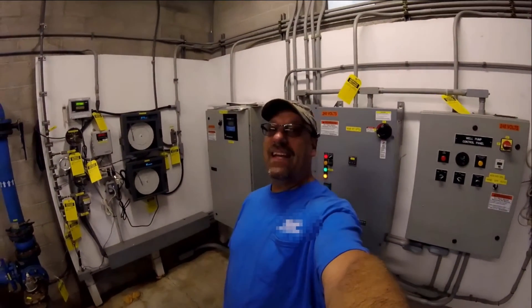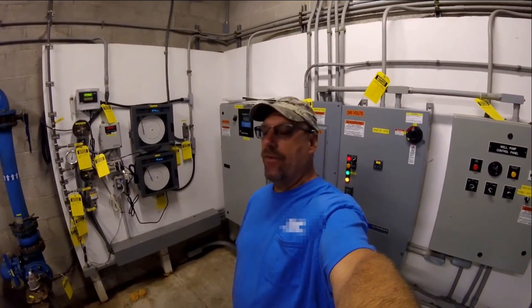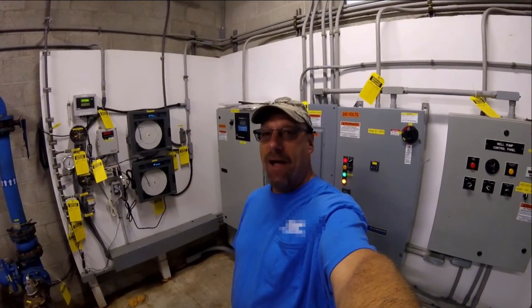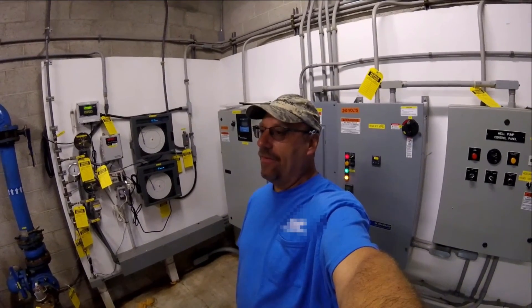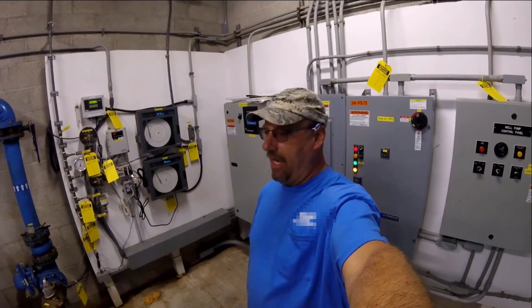Ladies and gentlemen, welcome to ZC TV. Today we're going to learn how to reinstall a chlorine analyzer with your friend and my friend, Andy, as well as an undisclosed person — John.